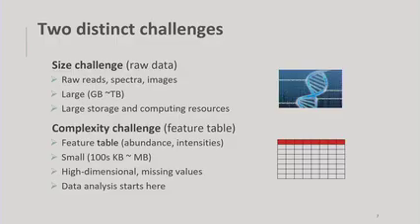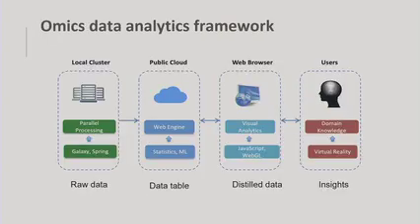The final goal is to generate that table, a high quality table, and the tools we developed in the past to address this aim are really fitting for this. For raw data processing, we use a big cluster and the local machine because it really saves time, and it takes 20 minutes or even several hours, sometimes longer. We generate a table. Once you generate a table, you can upload it to the server, usually hosted on the cloud, and now you can interact with your data through the web browser. Finally, it's you making decisions and writing the papers.